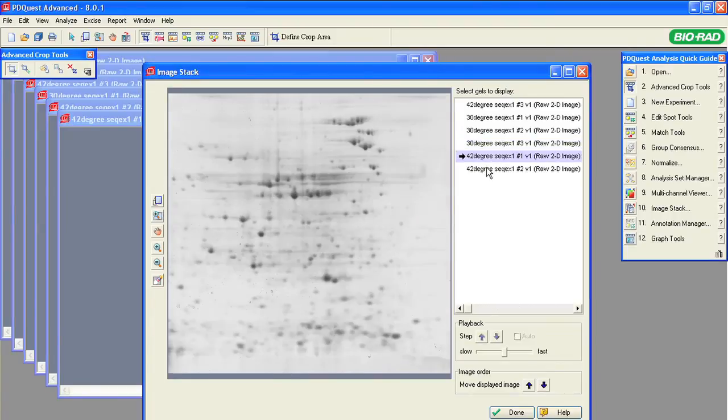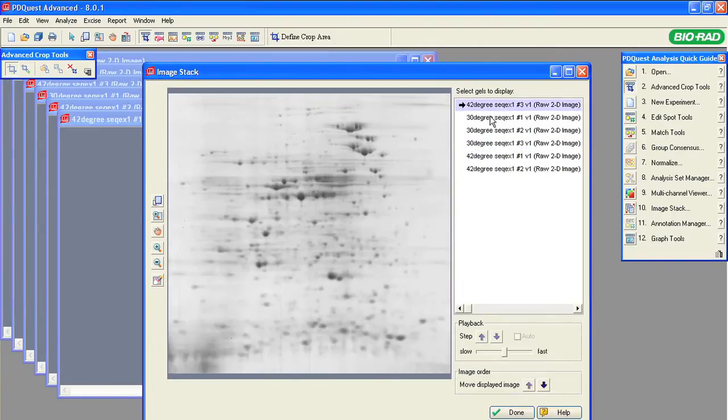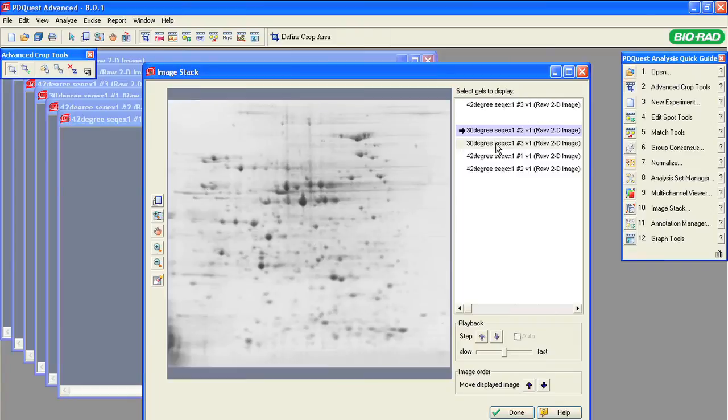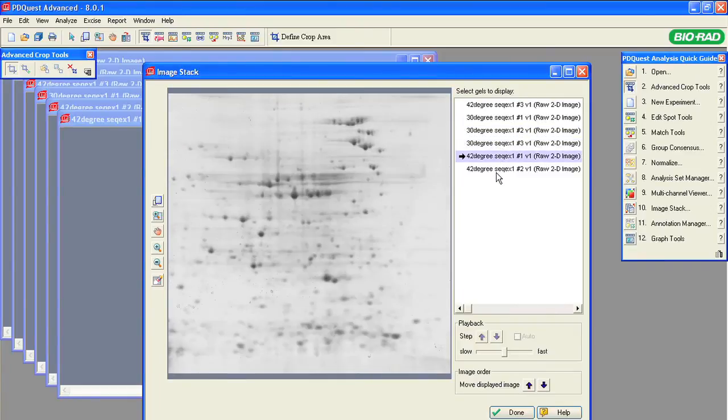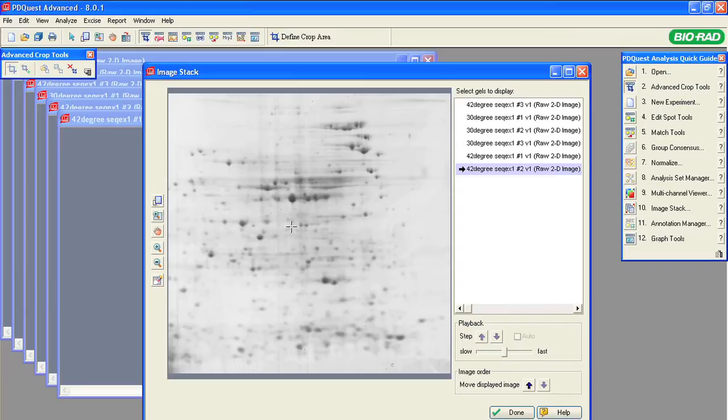In general, the central area of the gel image normally contains less distortion. It is best to have the anchor spot within a constellation of spots that create a recognizable pattern. Avoid selecting a spot of protein with post-translational modification that shifts the spot position between the gels.